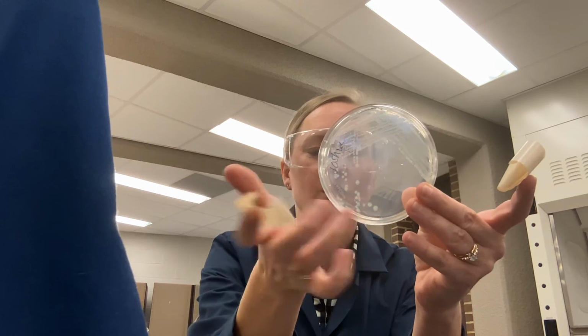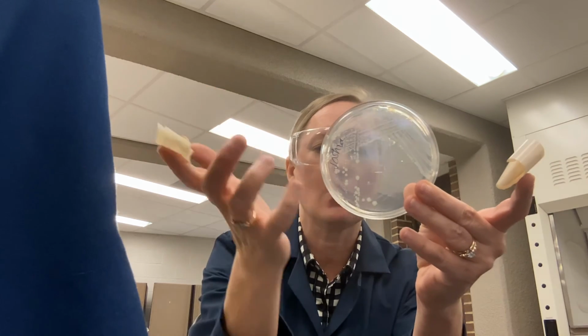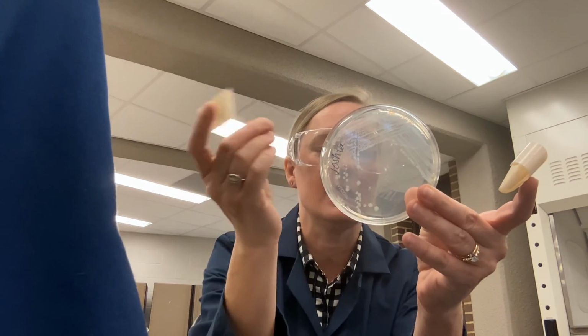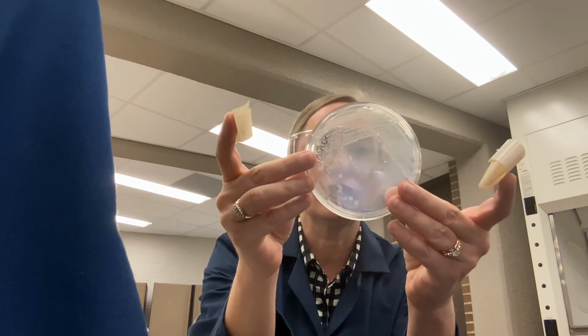We want these individual colonies to determine whether or not we have a pure culture. And if we didn't have a pure culture, we could pick one of these isolated colonies and do what's called subculturing and do this again on another streak plate. This is called the streak plate method.